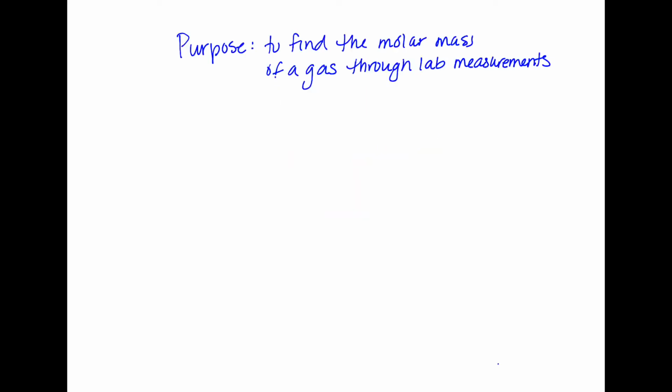This is our pre-lab video for lab 17, which is the molar mass of a gas. The purpose of this lab is to find the molar mass of a gas through some lab measurements.